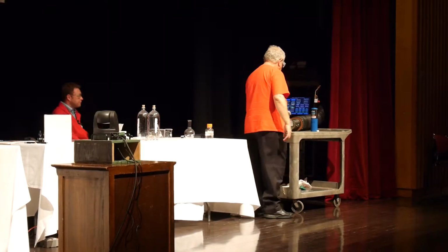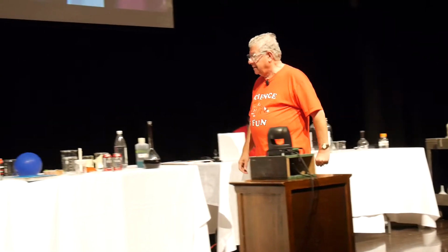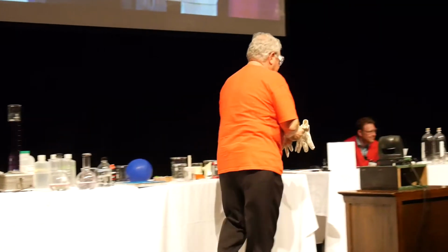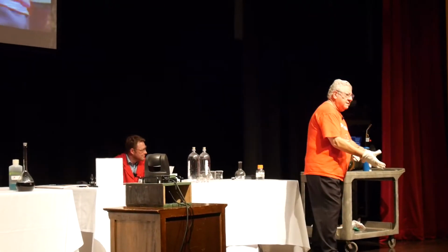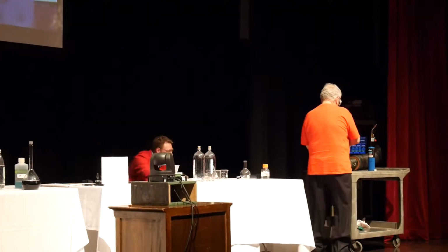And you also notice it's hot, so I need my gloves. I had my gloves right here someplace. And even though I'm going to pick up the flask with one hand, I better have my other hand ready and protected, right? We always follow the safety rules.